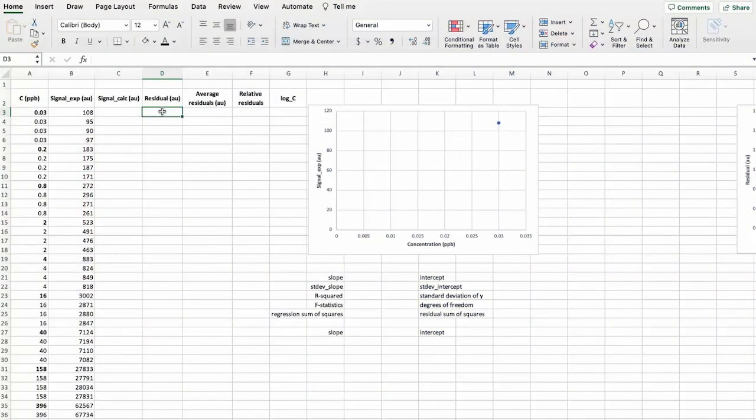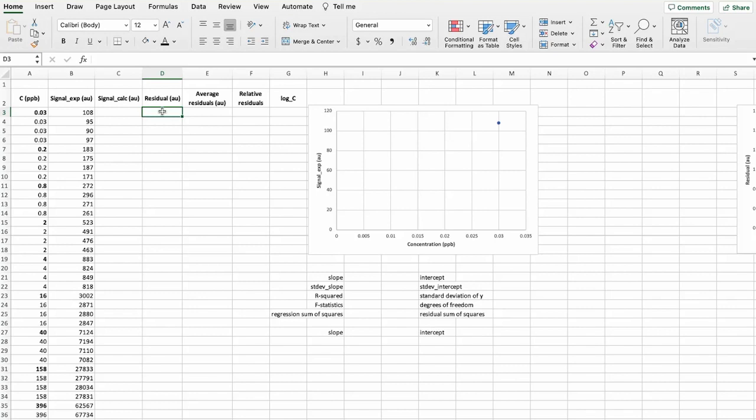Hi, in this video we will look at the example of linearity evaluation. We have carried out LC-MS-MS analysis of derivative-sized amino acid glycine in standard solutions.